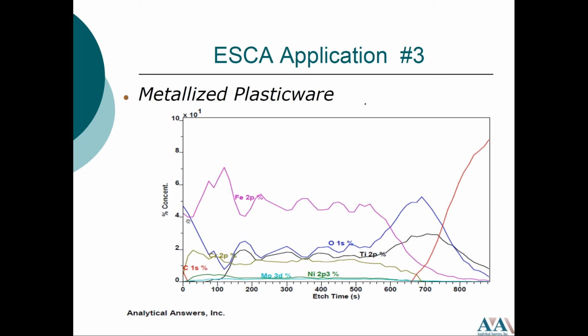And so that is a depth profile, and we can actually combine this technique, ESCA, with FIB, focused ion beam, and get an image of what's going on. So here is a cross-section of a metallized knife, and we see that there are alternating about 6 layers, similar to what we saw in this slide, of the stainless steel and the titanium oxide. Here is the adhesion layer, which is a little larger than those thin films, and this pure black region represents the plastic, or that pure organic.